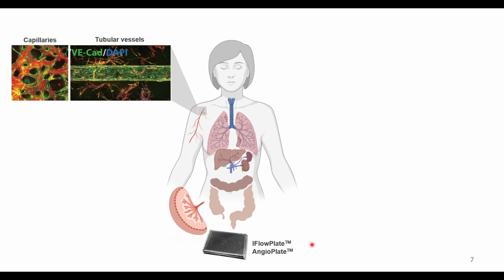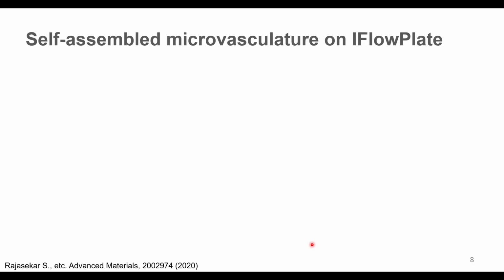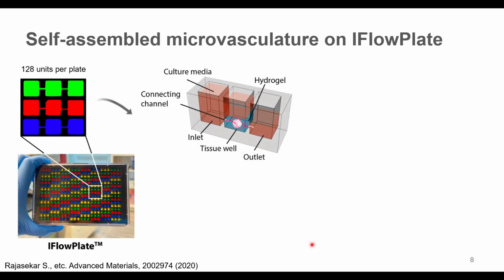So first, the blood vessel. How do we build a blood vessel model using this platform? In this case, we specifically want to create a perfusible, self-assembled microvasculature.